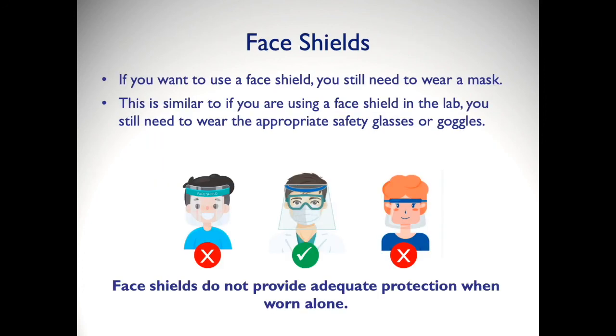If you want to use a face shield, you still need to wear a mask. This is similar to if you're using a face shield in the lab. You still need to wear the appropriate safety glasses or goggles. Face shields do not provide adequate protection when worn alone.